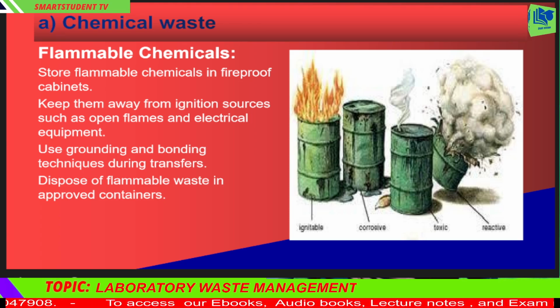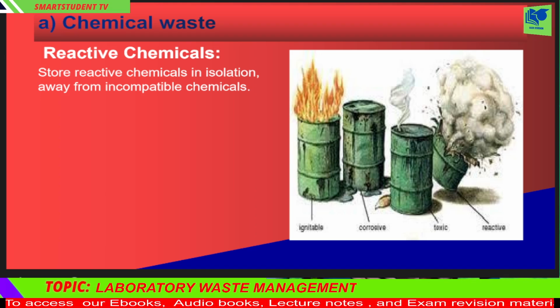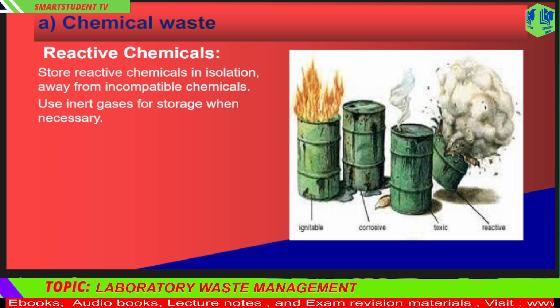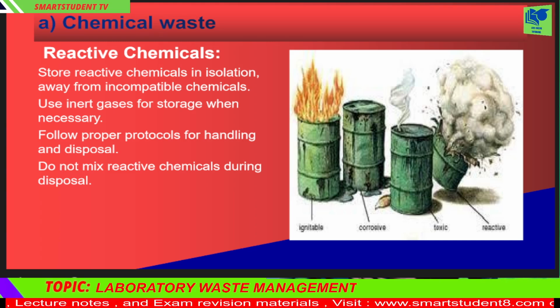C. Reactive chemicals. Store reactive chemicals in isolation, away from incompatible chemicals. Use inert gases for storage when necessary. Follow proper protocols for handling and disposal. Do not mix reactive chemicals during disposal.